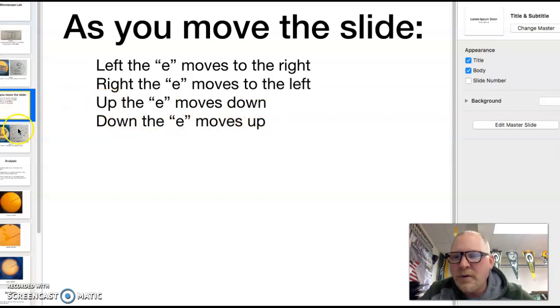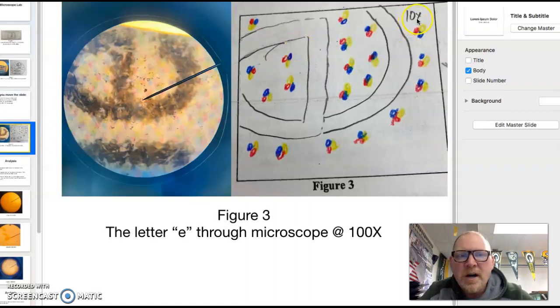So that's something to be aware of with the microscope, is that things get flipped around. We also saw this with the hand lens, the magnifying lens over against the wall. The next thing that we did was to look at them not only under 4-power but at 10 power, the 10x up here. So 10 and 10 on the eyepiece gave us 100 magnification. We can still see even more fuzziness and more of the red, blue, and yellow dots magnified.